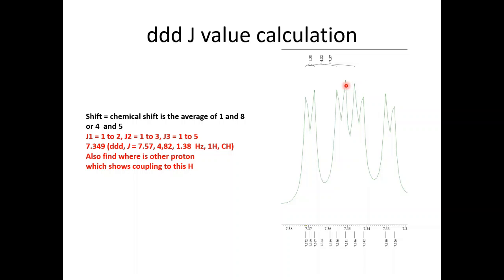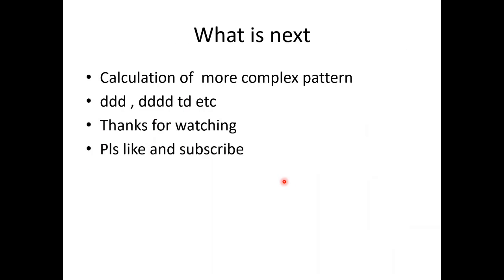Or you can take center peaks 4 and 5, click on this and click on this, add these and divide by 2, and average of these two peaks report the chemical shift.